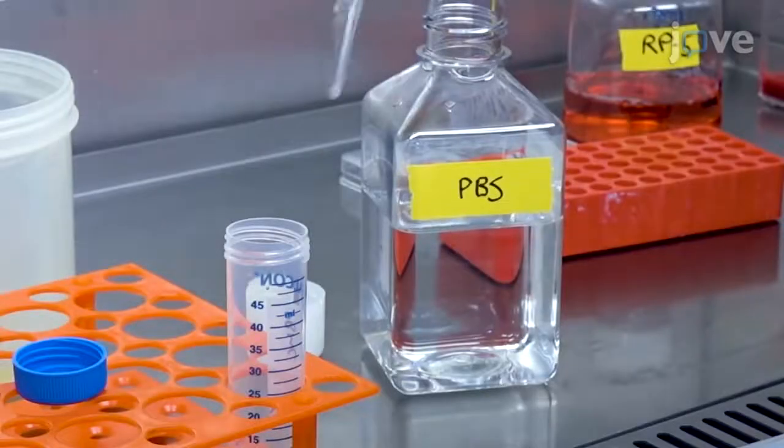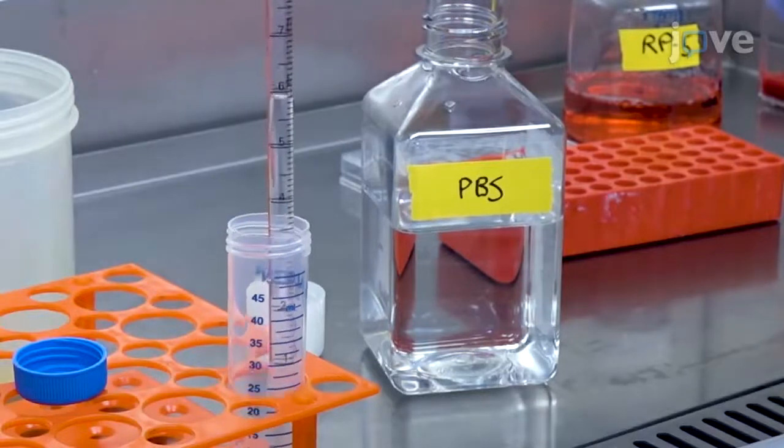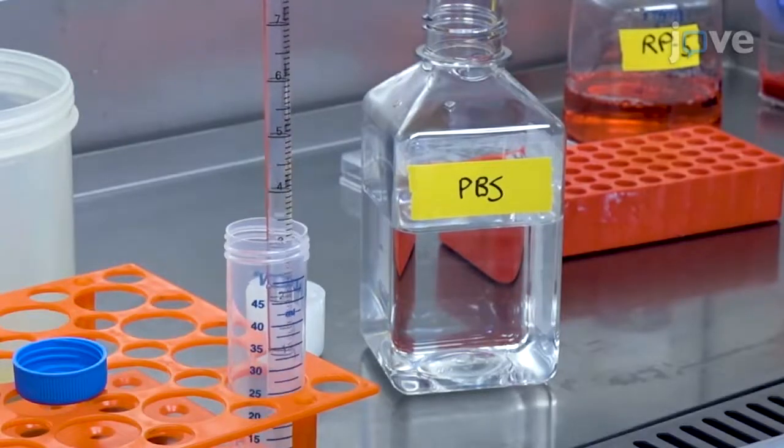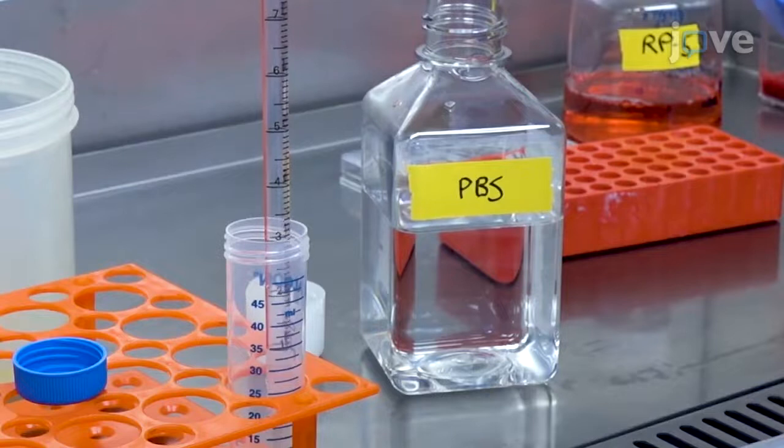After counting, dilute the cells to a 1 times 10 to the 6 peripheral blood mononuclear cells or PBMC per mL of PBS concentration.